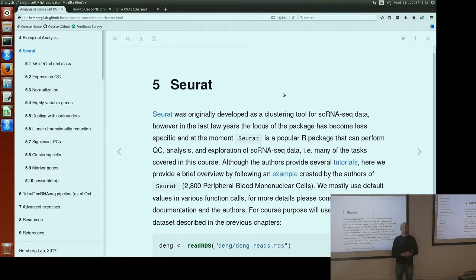The same people, okay. So Seurat, I think, was developed with 10x in mind, and they have a lot of integration with 10x output data. Once you have your data in some file structure on your disk from a 10x experiment, then with Seurat you can easily load these files and work with them immediately. So you don't need to worry about the single cell experiment class. In fact, Seurat provides their own class. Once you have your data, it creates an object with a Seurat class, which is not related to the single cell experiment class.